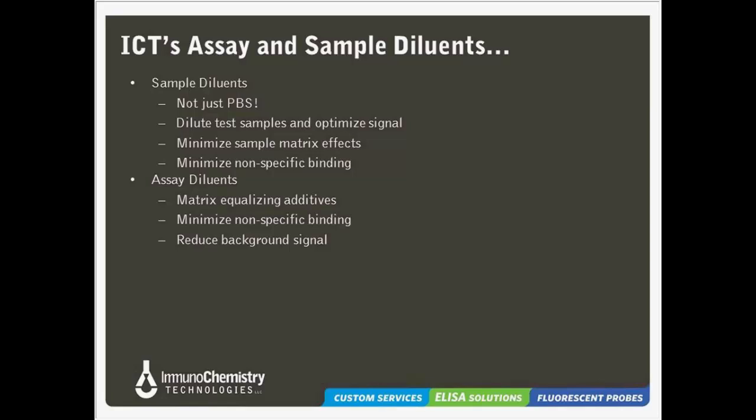Well, if you run an assay in easy buffer like PBS, BSA, and you compare that to a spike sample that you ran in your serum matrix, your easy sample, your permissive matrix, will capture very efficiently in your standard curve, but it will not capture very efficiently in the sample wells, and so you're going to underreport what's actually present in your sample wells.